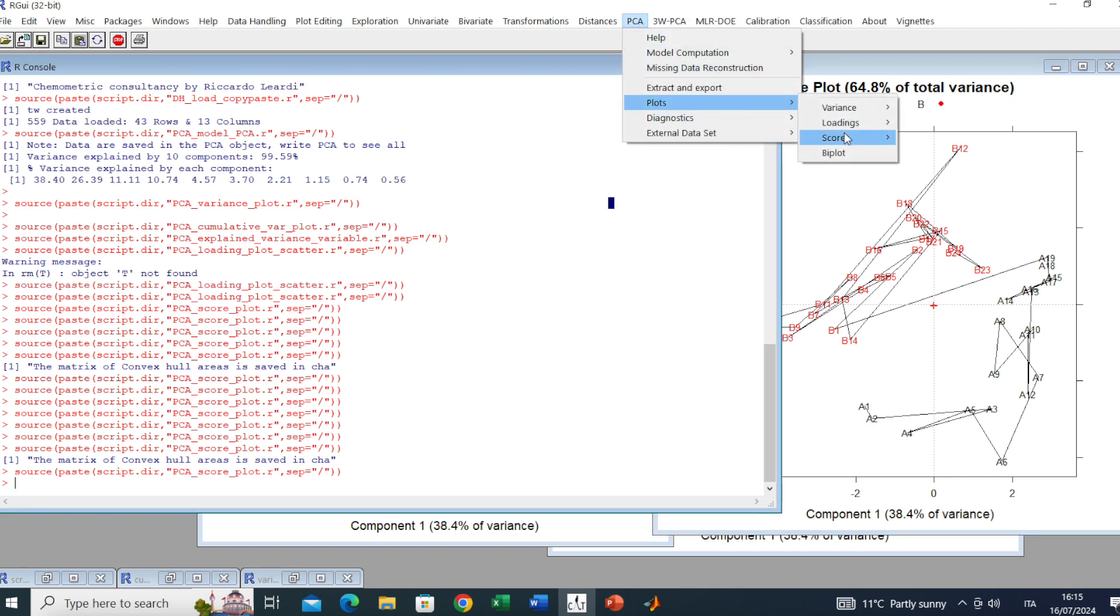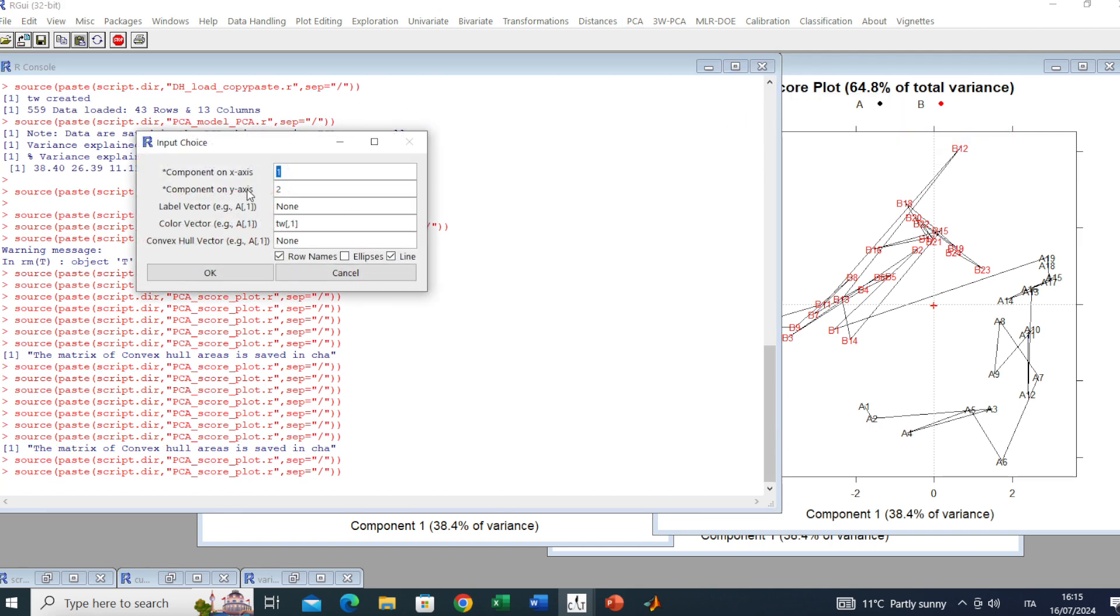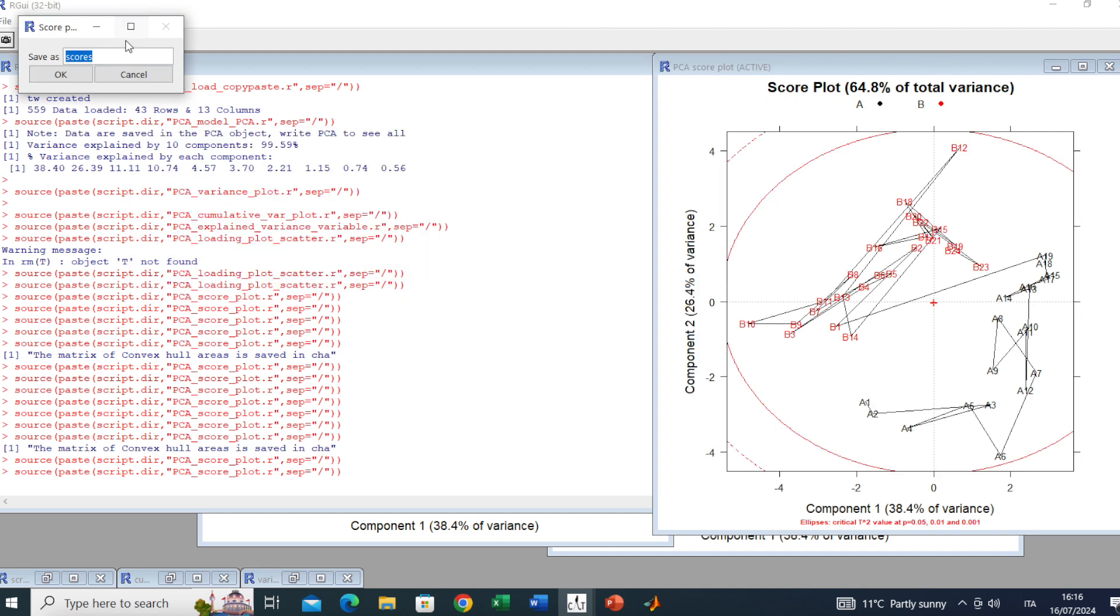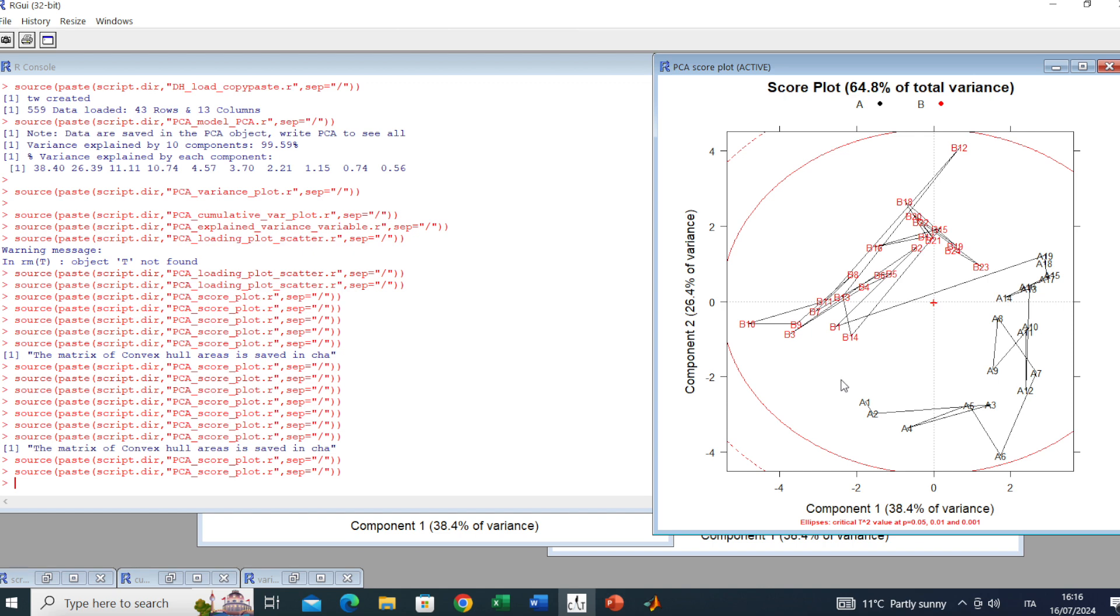Going back to the same score plot menu, you can add also the ellipses telling the T-squared statistics according to a different level of significance. Let's have a look at it. You have different levels of significance. Anyway, here we are dealing with two families, so not the point of using it right now.